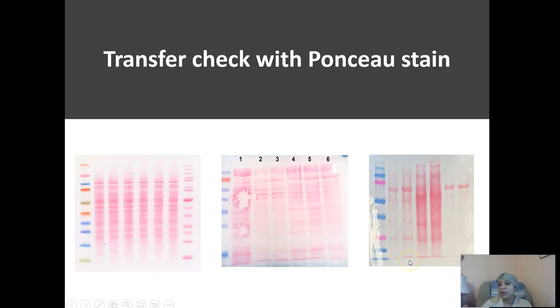Here's another one. This looks frankly like somewhere where maybe they were doing an immunoprecipitation experiment. So maybe these two were their extracts in whole, these were maybe their purified ones, and then after another round of purification, and this is the protein they're looking at. Who knows? But obviously, again, you can see the quality and the amount of proteins. Typically, if you're comparing in Westerns, you want all your sample pairs, in this case, to have the exact same amount of starting material. That's why the equalization step is important.